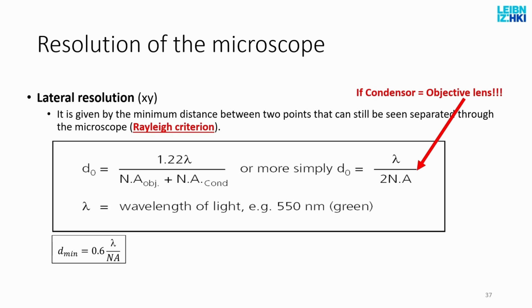So this also means that when you set up your experiments, now you are much smarter and you say, my nuclei, which are big, should be measured with red because I don't need the resolution. And my actin filaments, or my ZO1 signal, or cadherin signal, should be measured with blue.